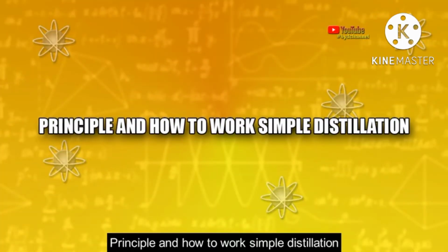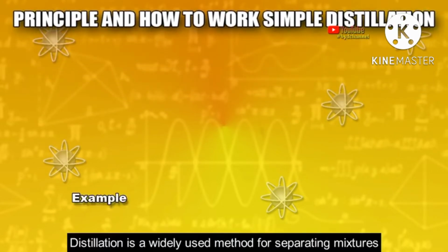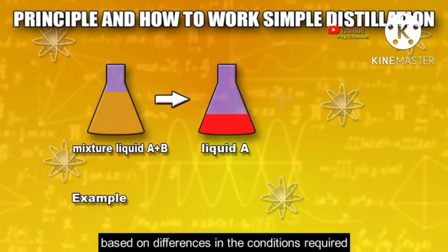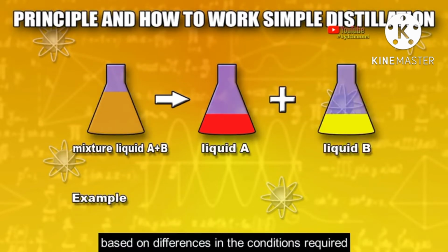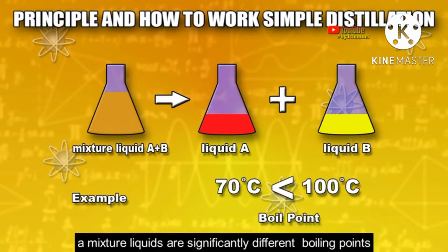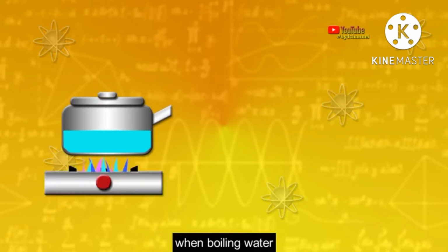Principle and how to work simple distillation. What is simple distillation? Distillation is a widely used method for separating mixtures based on differences in the conditions required. Simple distillation is used when a mixture of liquids has significantly different boiling points. A simple example from daily life is boiling water.